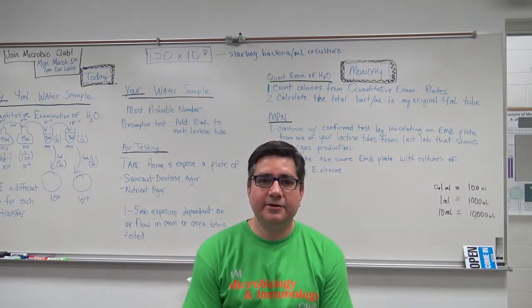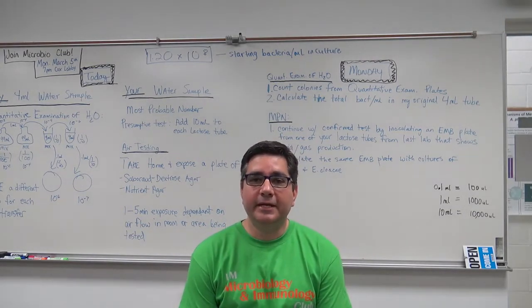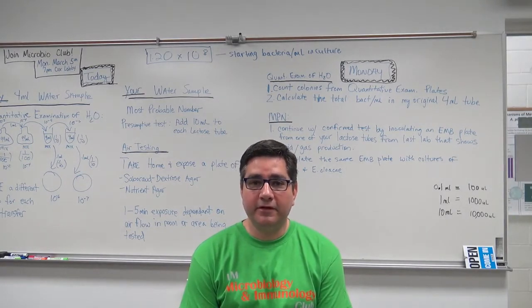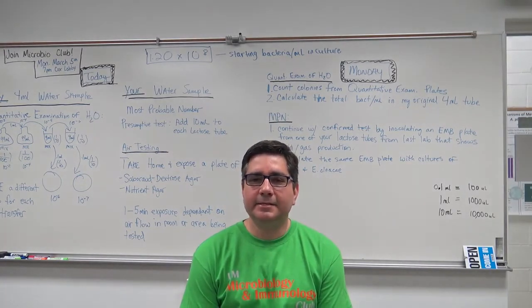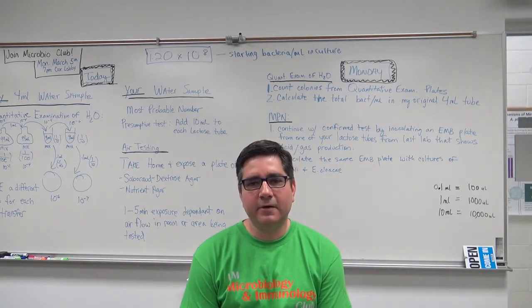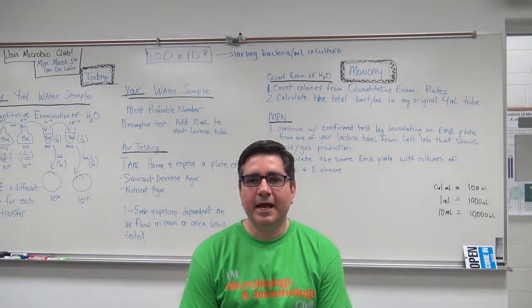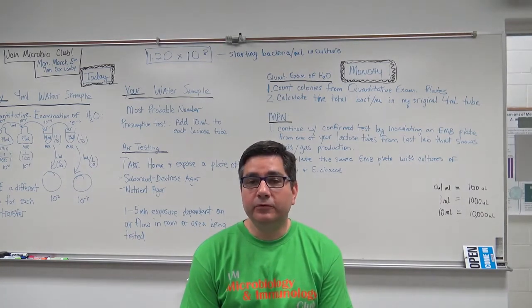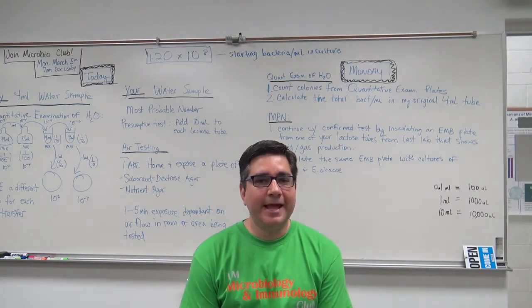By conducting a serial dilution and plating a known volume, one can estimate the number of bacteria the starting sample volume contains by simply counting the colonies that arise after spread plating and back calculating. Remember, a colony forms from one single bacterial cell, so by diluting out the initial culture and spread plating it, you're spreading out the individual bacterial cells across the surface of your plate.